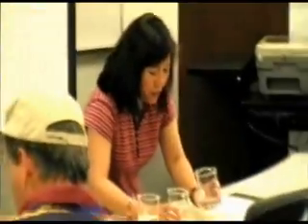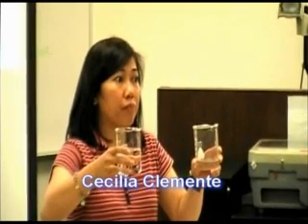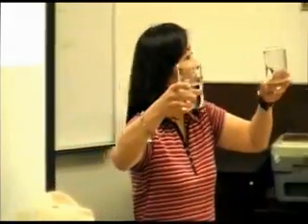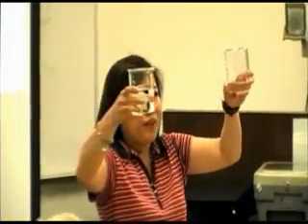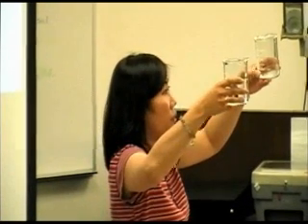Okay, I'll start off with these two beakers right here. I want you to make observations as I do the activity, or as I do the demonstration. Make observations, write them down, and formulate hypotheses or inferences in your mind, in your notebook, about what I'm doing, and anything that you observe as I do the demonstration. So, can you tell me what you see right here? Water. Liquid. Color.